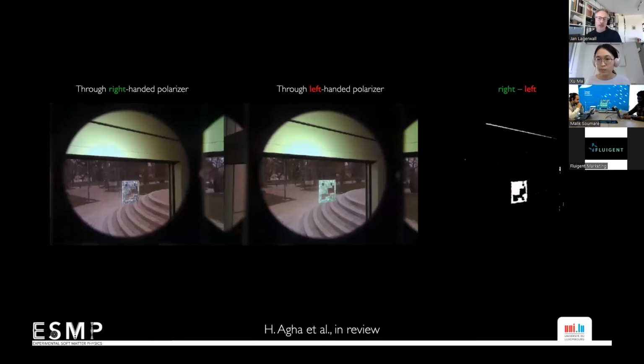So what we are going to do is we're going to make them invisible. Just first, this is not an invisible one because we didn't yet have infrared or UV seeing cameras on this device. So here's just an example that the background subtraction works. Here is a marker that we made in this way with CSRs. This is in the channel that blocks the reflection. This is a channel that sees reflection. And here you see the subtraction. And again, the background is gone and only the marker is visible.